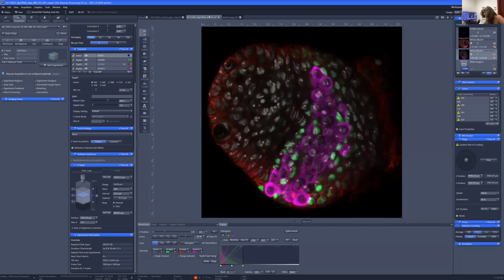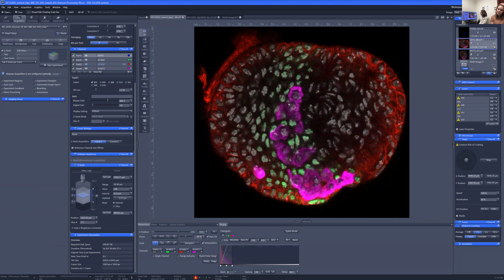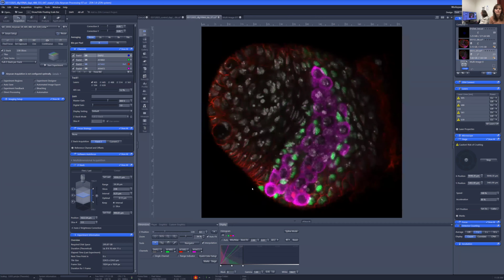No. So, okay, sorry. Basically, this is the number of egg stem cells in this one image in a control sample, and then in a sample where I've knocked down the expression of a gene, I see a lot more egg stem cells. And so this was an example of a really successful experiment that was very exciting because I was really excited about the possibility that this gene was doing something. And basically what I showed is that by getting rid of the expression of this gene, germ stem cells, egg stem cells increase in number.